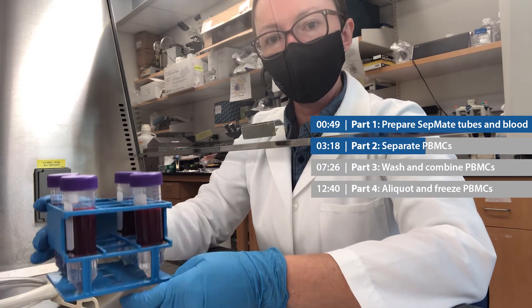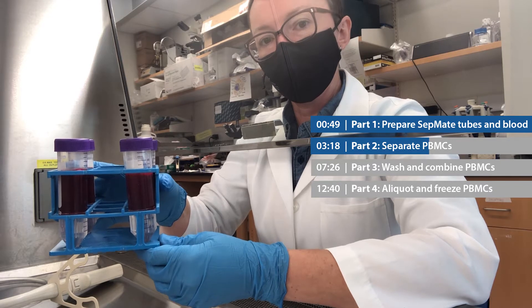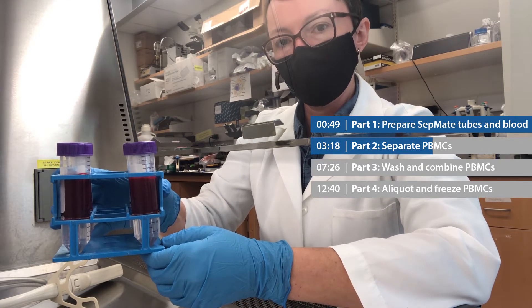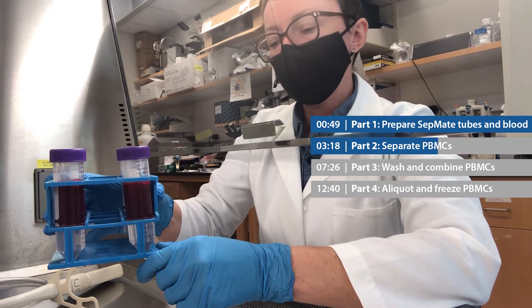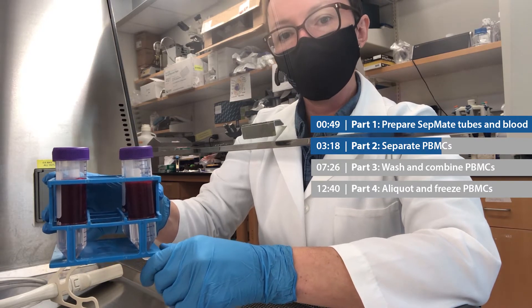Now that I've got all of my blood carefully layered over my lymphoprep in my SepMate tubes, I'm going to very gently walk this over to the centrifuge. When I spin it, the red blood cells will pellet to the bottom of the tube, but the PBMCs and the plasma will stay on top, and I'll show you what that looks like.